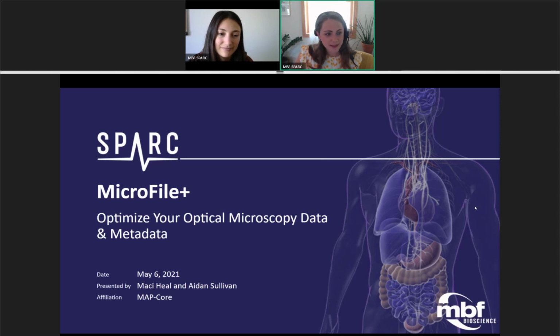Though we'll be discussing a SPARC-specific application of MicroFile Plus today, the tool is freely available for download, and we encourage you to employ the powerful utility in your image analysis and data sharing workflows.